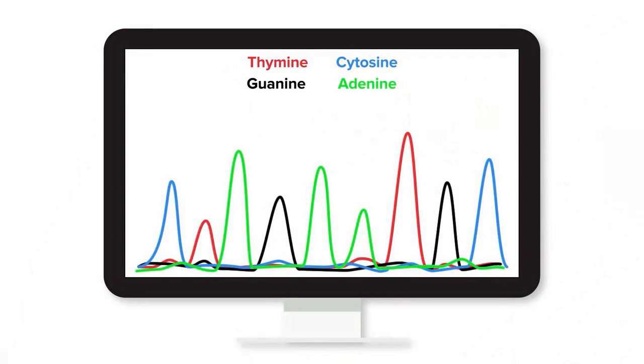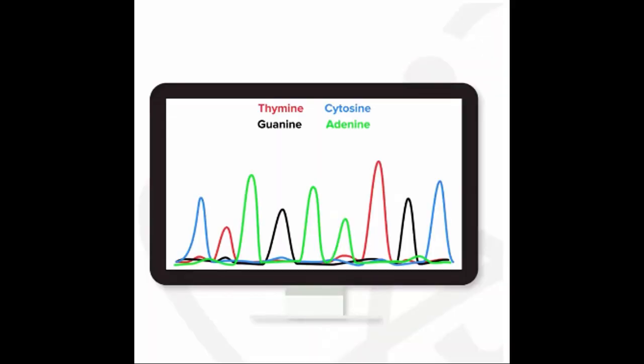Now it's your turn to practice analyzing some sequence data. For the DNA sequence readout shown on the screen, determine the actual DNA sequence. Pause the video and write down the sequence of nucleotides. When you return, you can check your answer. Let's see how you did.